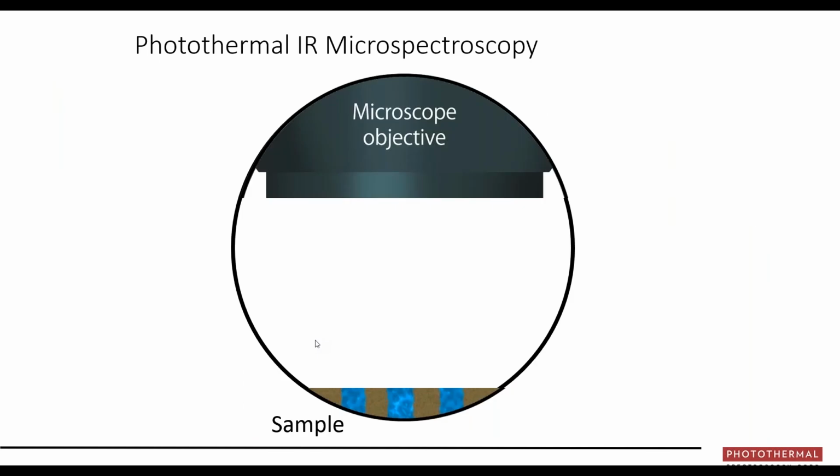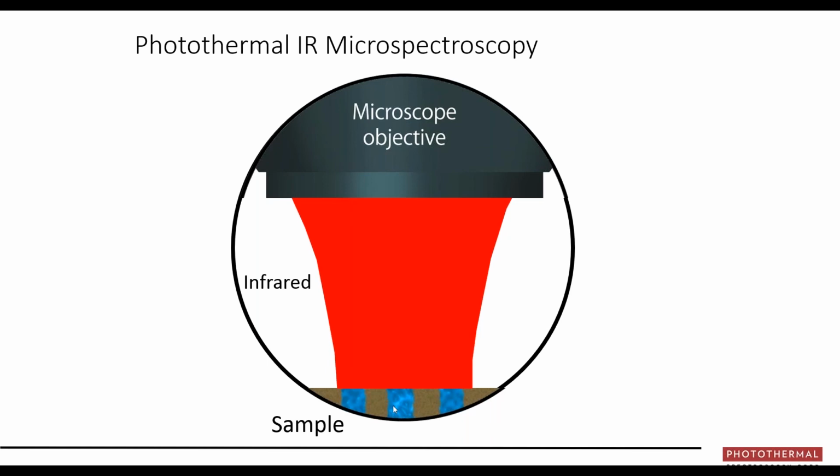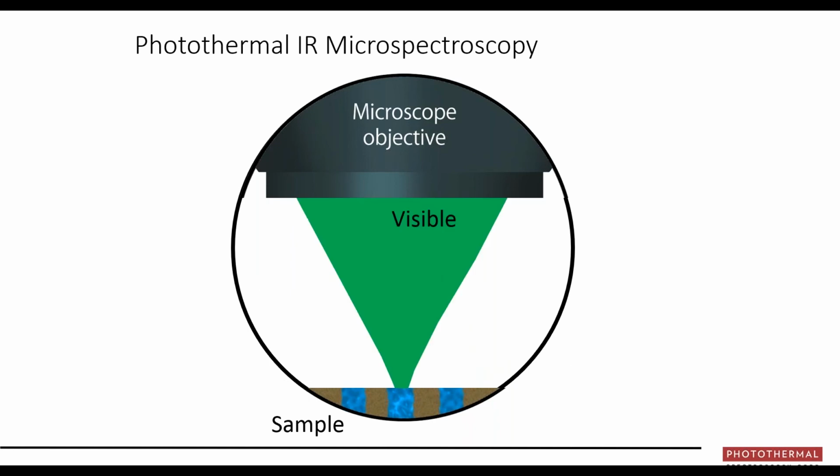So how does this O-PTIR technique work? Well, we start out with an infrared microscope objective, and we have a sample down here, and the sample has some heterogeneity. So let's imagine that these blue regions are going to absorb infrared light in the wavelength range that we're going to use. Now, if we were to try to measure this with conventional infrared microscopy, we would focus our light to a spot that could be much bigger than these features of interest, again limited by that IR diffraction limit, that Abbe diffraction limit. Well, if we were to image it with visible light, however, we could focus that visible light to about 10 to 20 times smaller than the infrared light. But we want to do a chemical analysis here using infrared. So how can we use these two ideas together?